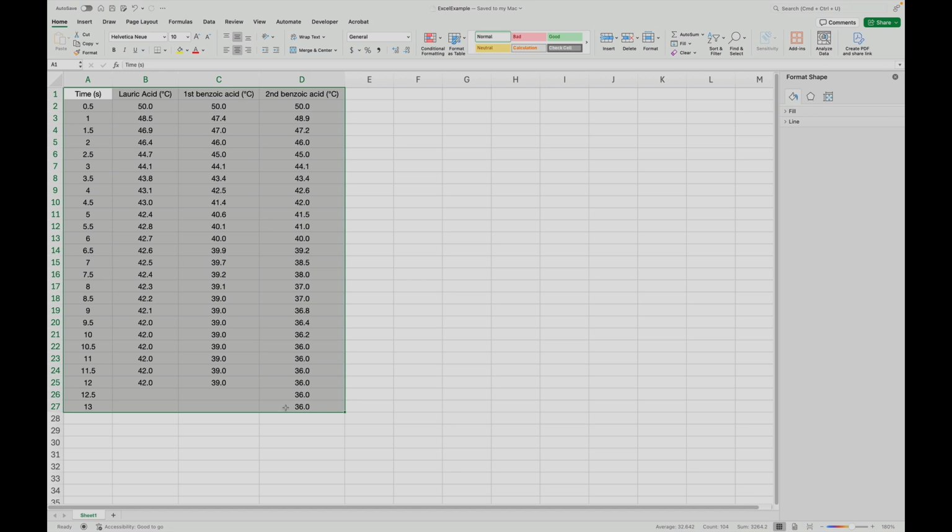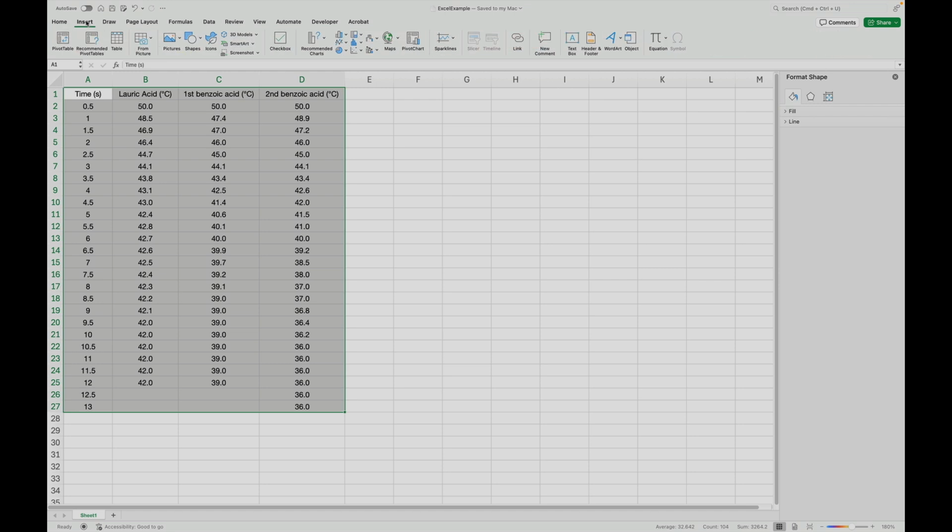And what we want to do is we want to make an XY scatter graph. So in this version of Excel, and again, yours might be different because I swear every one of these is a little different, I would go insert, and then there's different kinds of charts, and the one that scientists like is usually this one. You want what's called an XY scatter plot, and you don't really necessarily want any points or any lines, excuse me, on it, but you can use this one which has lines too, but we'll see how that's not maybe as helpful.